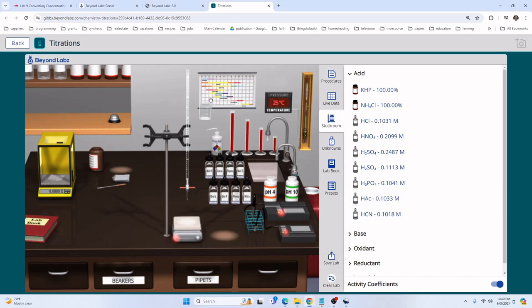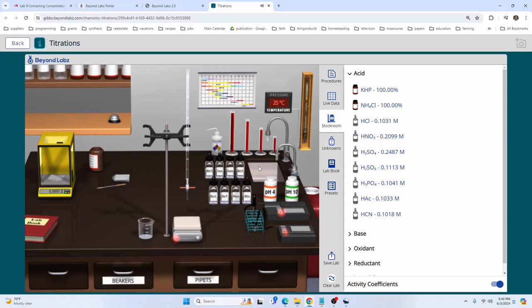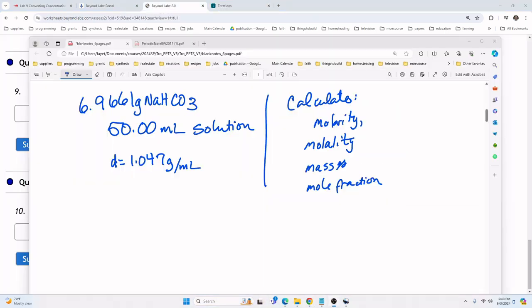Let's go ahead and drag it over. Next we want to continue to fill this graduated cylinder until it's full — it'll snap back when it's full. So we now have our solution created. We have added our seven grams of sample to the 50 milliliter graduated cylinder. That's actually all the information we need from the lab.